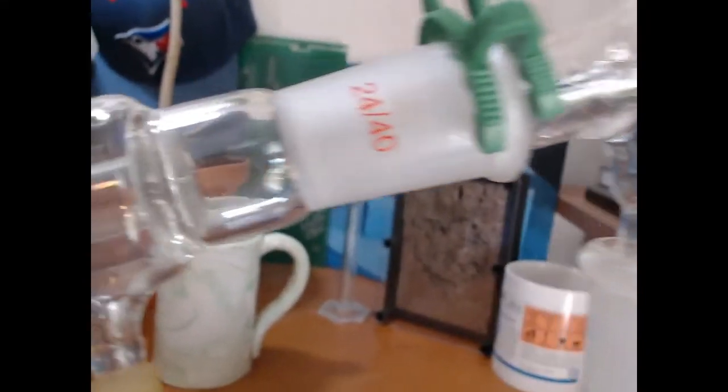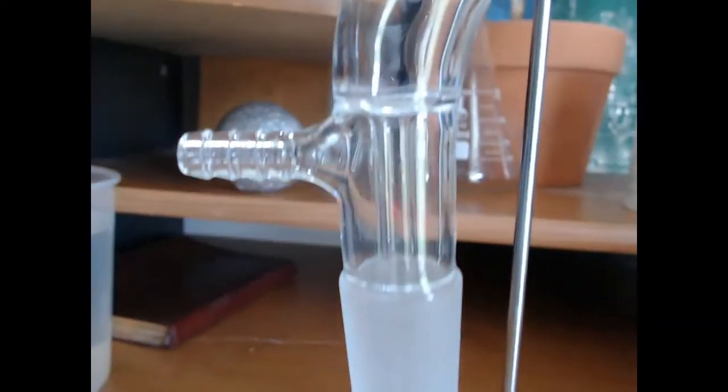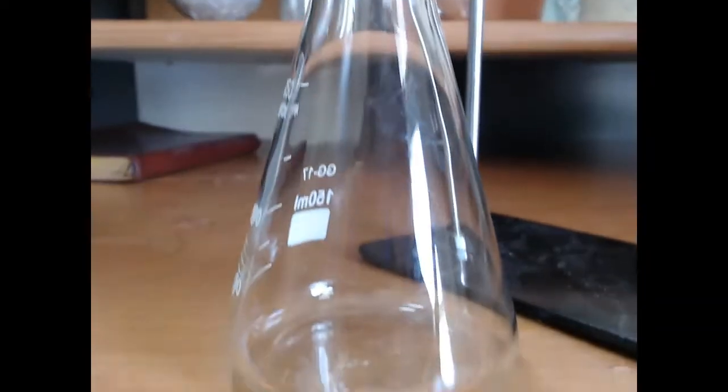The steam will travel up and out of the round bottom flask and enter the condenser, where the steam will be turned back into water, which will flow down the tube and is collected by the receiving flask.